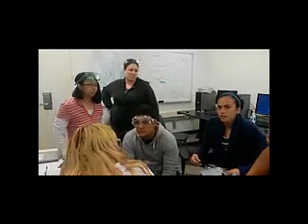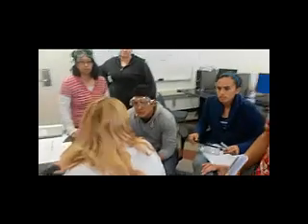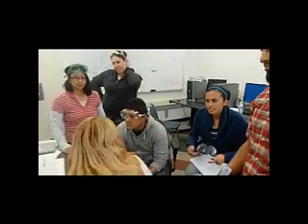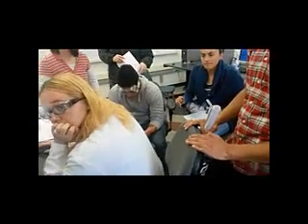It'll still be here by Thursday, right? We're going to be here Thursday doing this anyway. It's going to be here until I leave the school, which will be this time next year. So worst case scenario, the software and everything, nothing is deleted. Yeah, it's saved. It's going to the server, which has a huge amount of space, so nothing gets deleted, and it gets backed up.